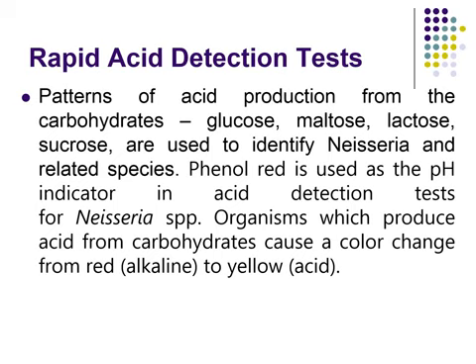So the test is called carbohydrate fermentation or sugar fermentation, including glucose, maltose, lactose, saccharose.